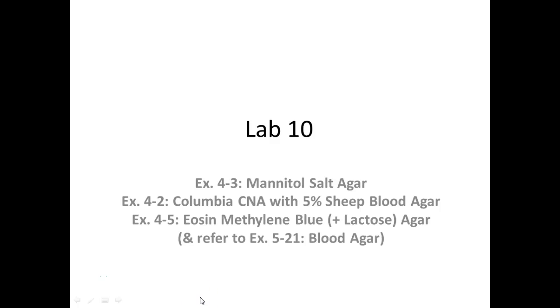Alright, so lab 10, 3 different exercises, and we actually have you refer to one of the other ones for some pictures. And I have demo plates of almost everything today that we'll also take a look at and compare to your unknown organisms. So we have Mannitol Salt Agar.